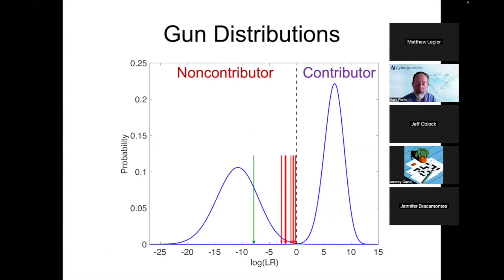You're talking about something else. You're talking about the type of low contributors at maybe 1%. You're just seeing low match statistics that have higher error rates, that are known to be higher, that are hanging around zero and have nothing to do with this case. They're just not relevant to this case because a log LR of negative a half is not the same as a log LR of negative 7.5. And the distributions are showing you where you are along these curves.